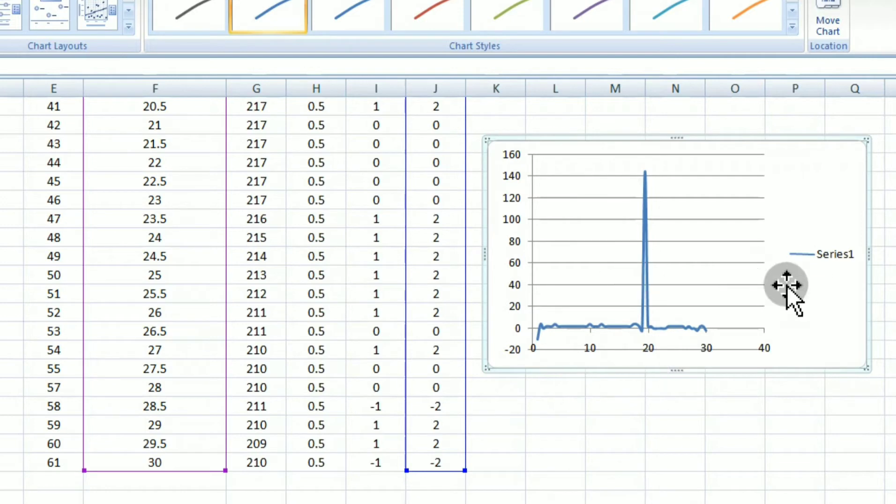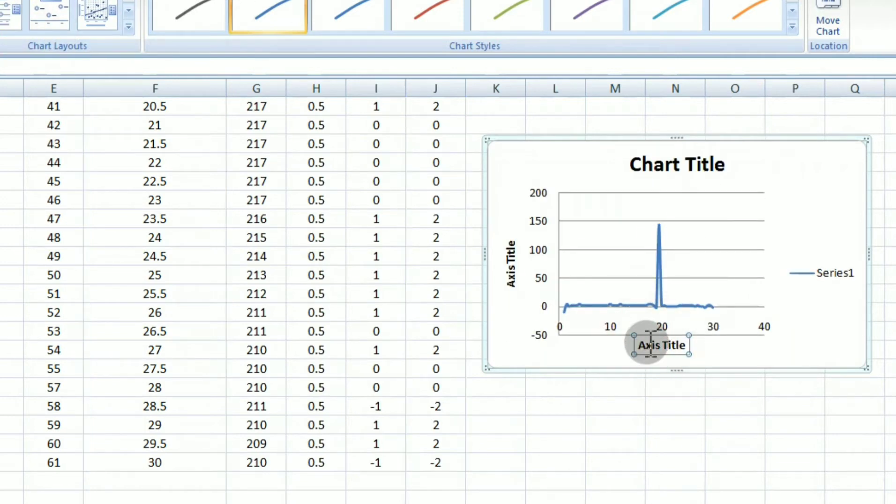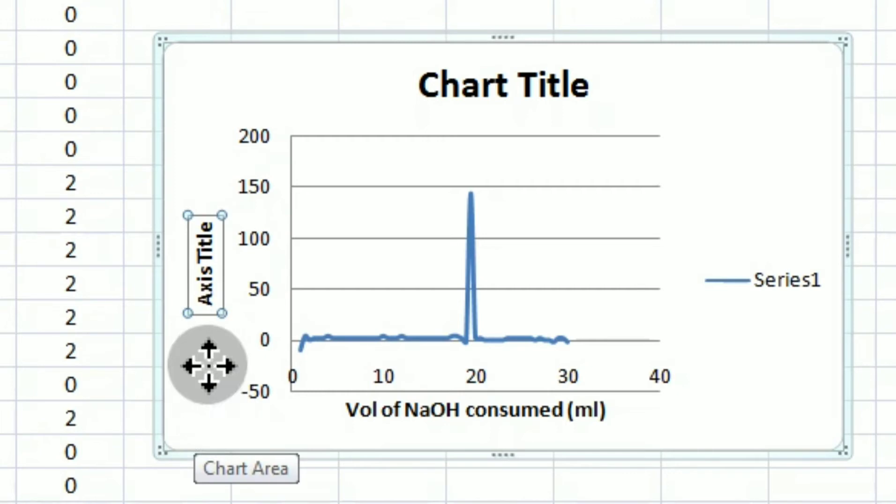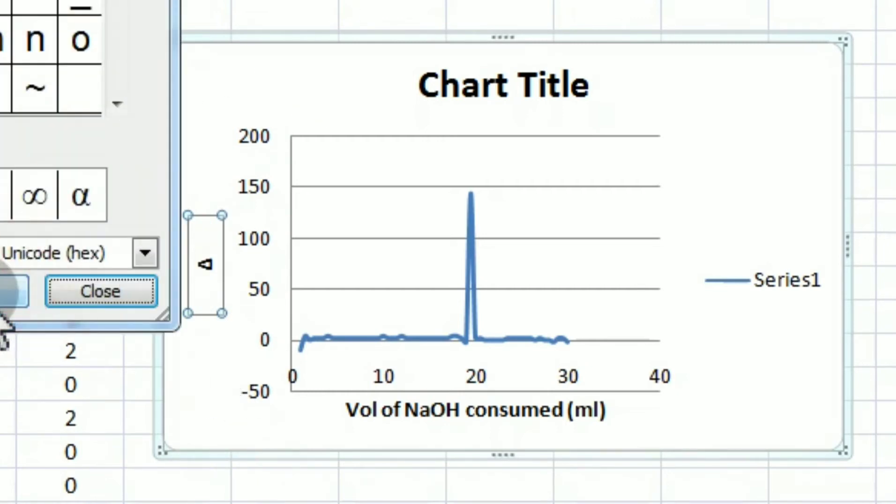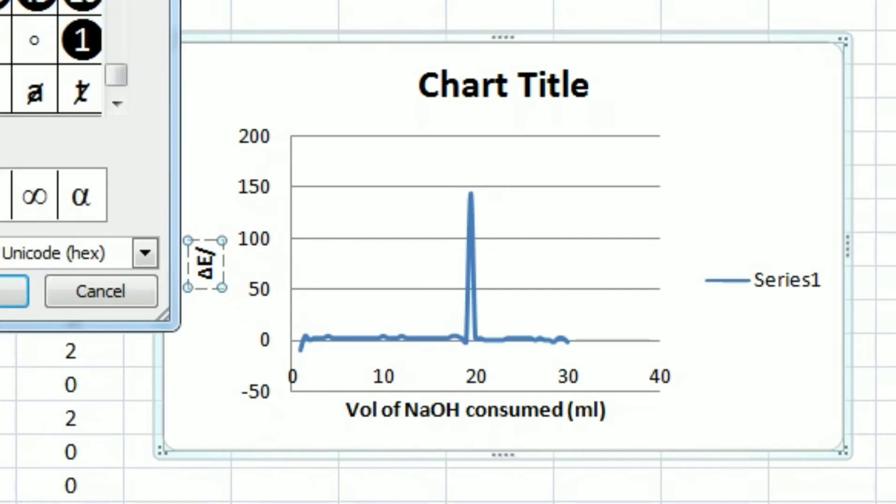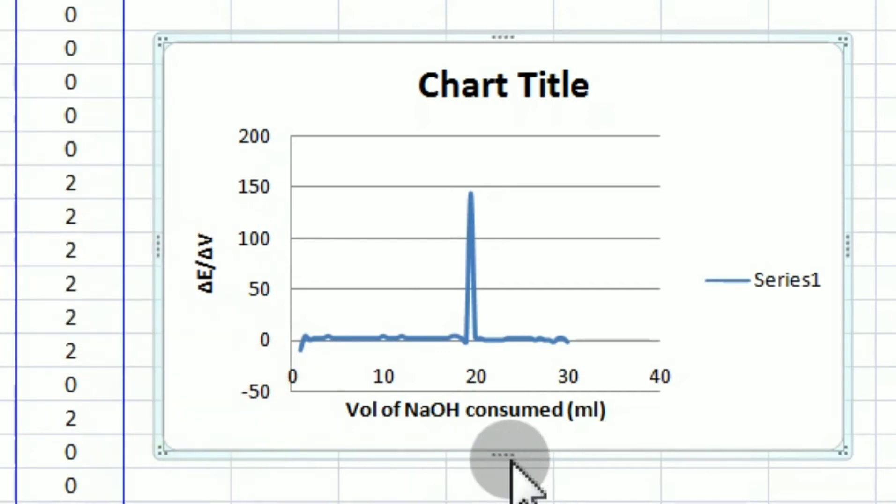So here, the tip of the peak, when you put the cursor at the tip of the peak, you can know the volume of sodium hydroxide that is run down to get the endpoint. You can also just note down or label the x-axis and y-axis using the Excel options. So the same thing is being done there. We have noted down the x-axis as volume of sodium hydroxide that is consumed. And then we are noting down the y-axis label as delta E by delta V. And you can also note down the chart title as potentiometric titration.